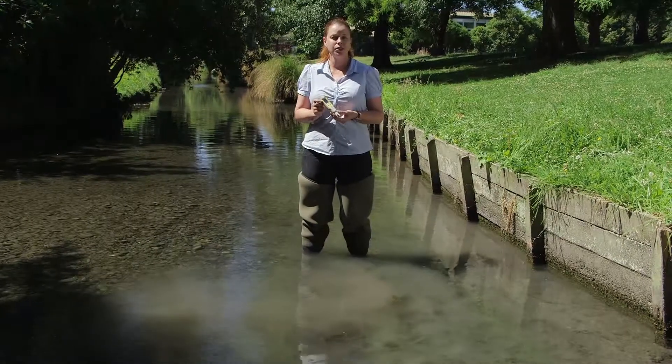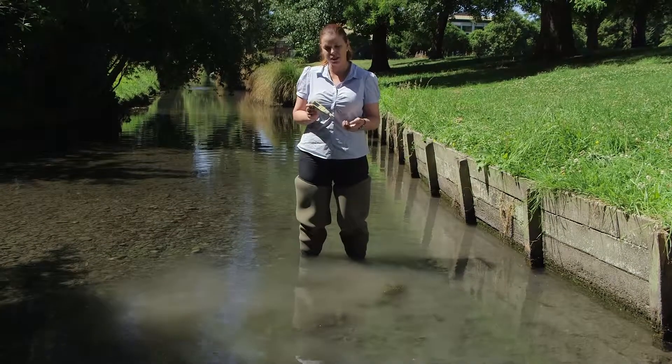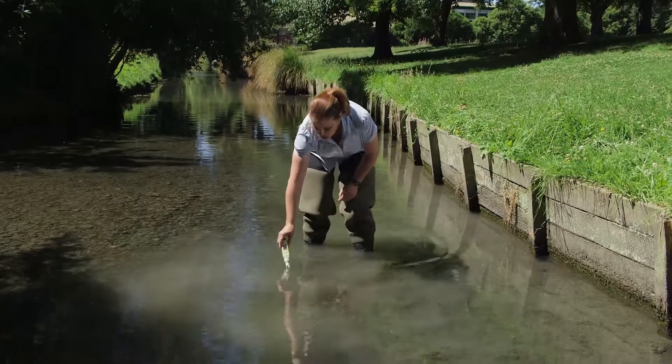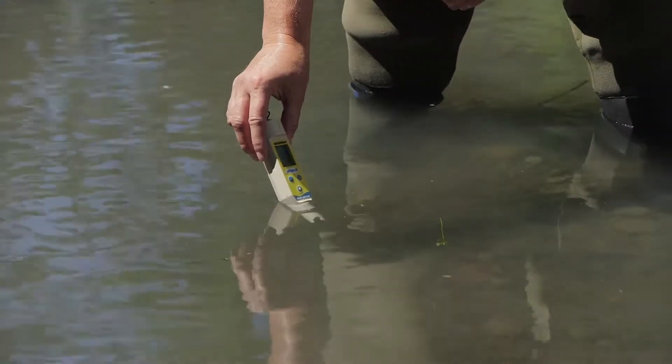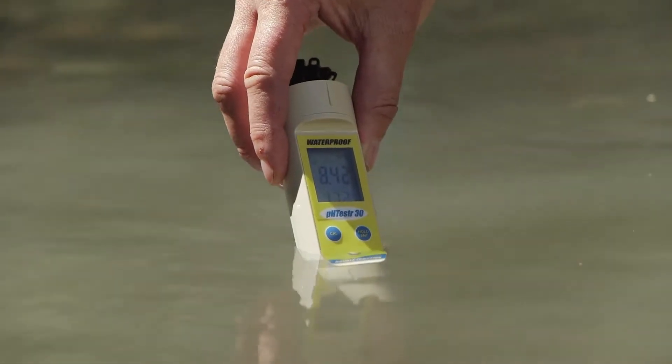The meters are very easy to use. Turn it on — you've obviously calibrated it previously and rinsed it in clean water. Now you just place it in the stream or in your sample and hold it there, watching the pH reading until it starts to stabilize.